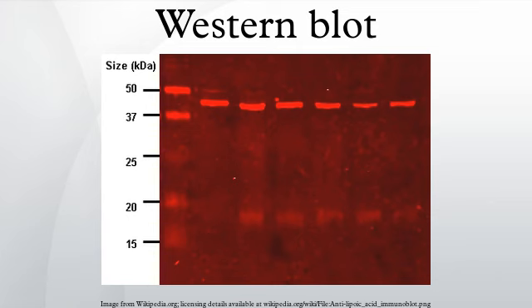Fluorescent detection. The fluorescently labeled probe is excited by light, and the emission of the excitation is then detected by a photosensor such as a CCD camera equipped with appropriate emission filters, which captures a digital image of the Western blot and allows further data analysis such as molecular weight analysis and quantitative Western blot analysis. Fluorescence is considered to be one of the best methods for quantification, but is less sensitive than chemiluminescence.